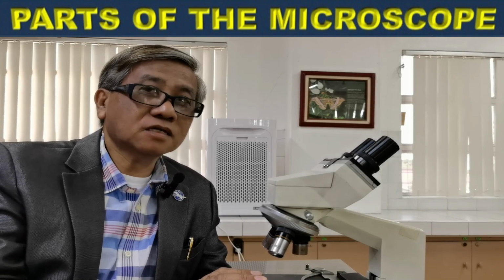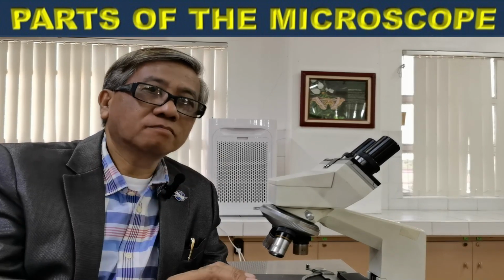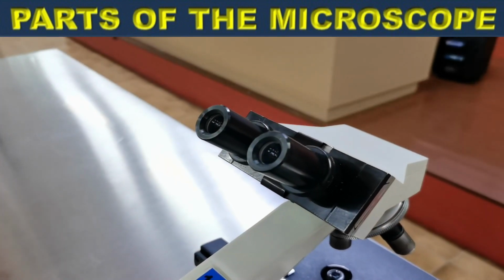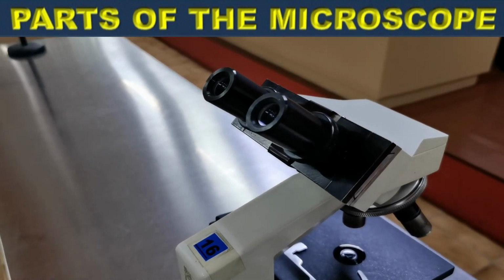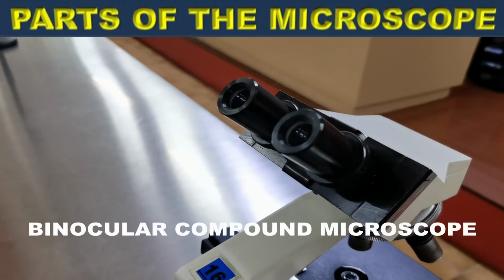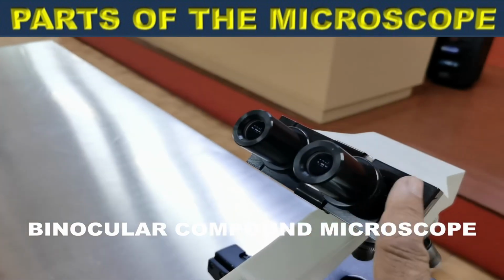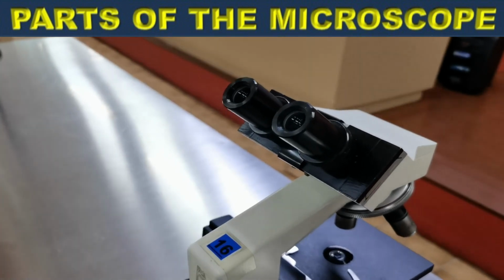Let us examine the different parts of this compound microscope. Alright, so let us now go into the details of the parts of the compound microscope. Now, this compound microscope is what we call a binocular compound microscope. Binocular because there are two eyepieces or two ocular lenses, hence the term binocular.